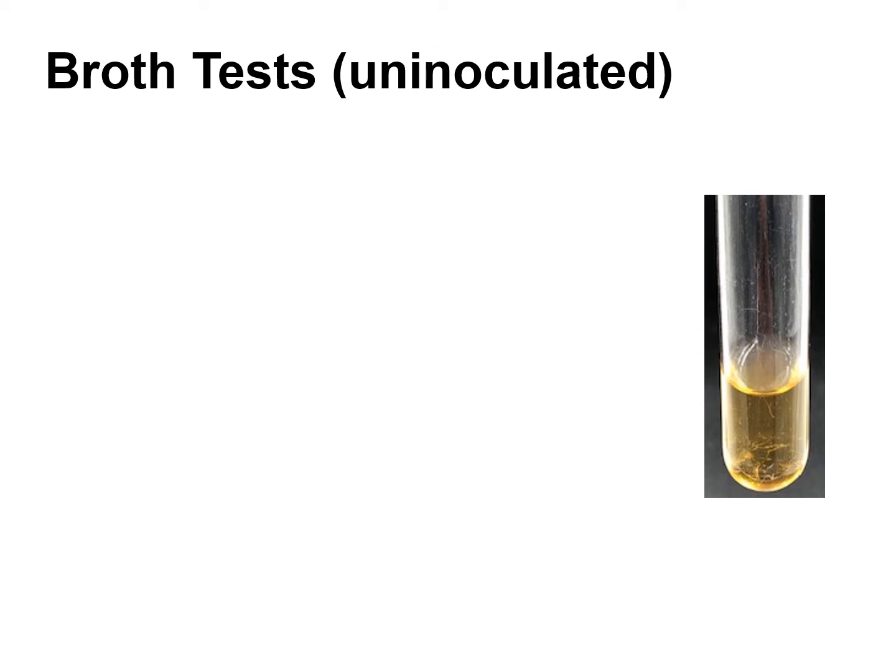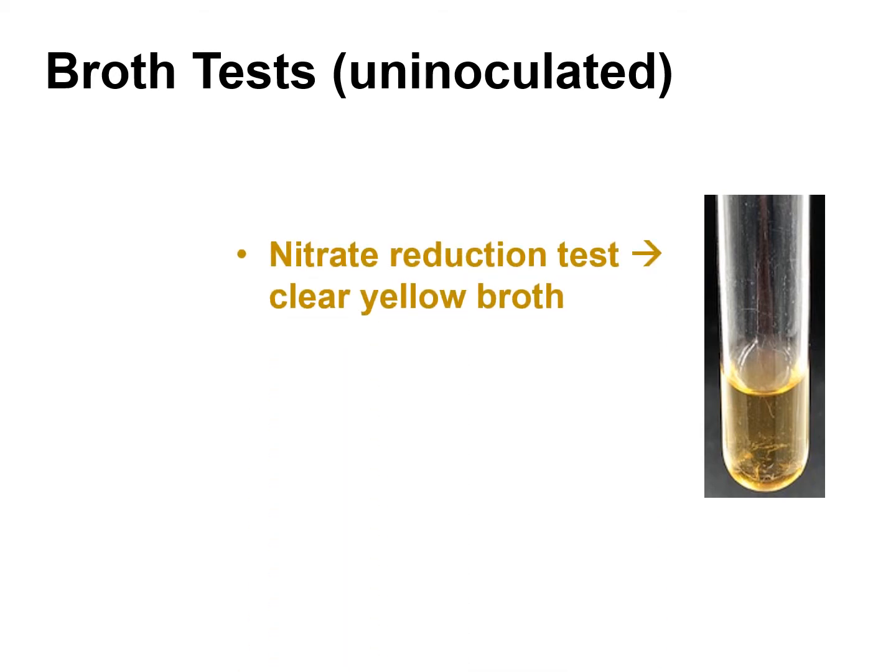Now there's another test that we're going to talk about, and it's another test done in a test tube, okay? So it's another broth test, and so you start off with some broth. Now this test right here, it's called the nitrate reduction test.